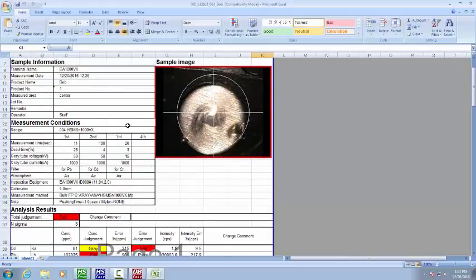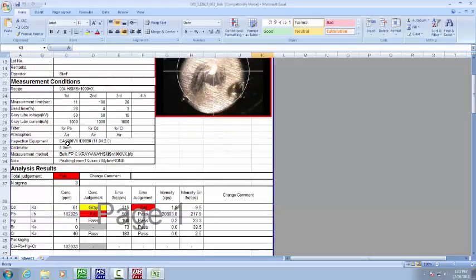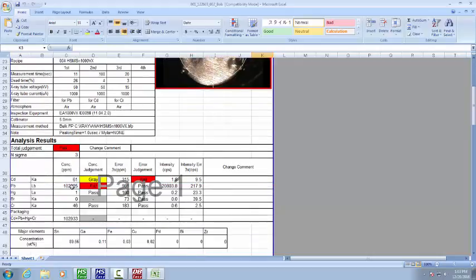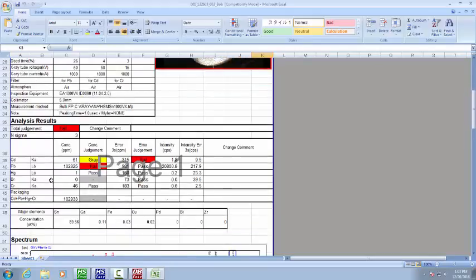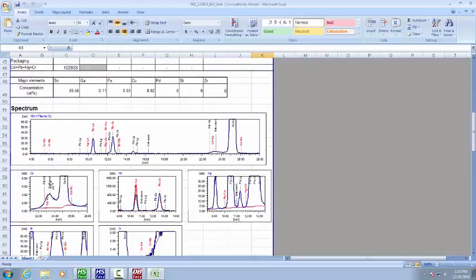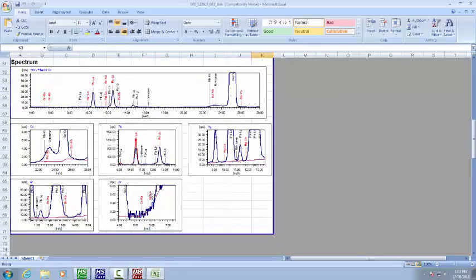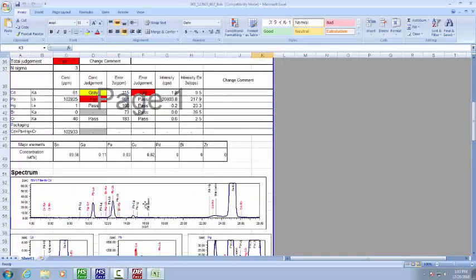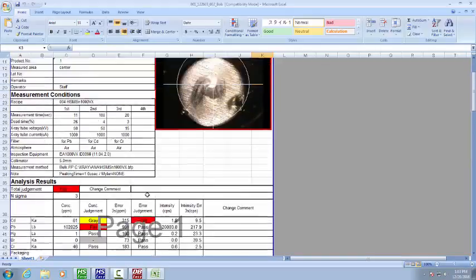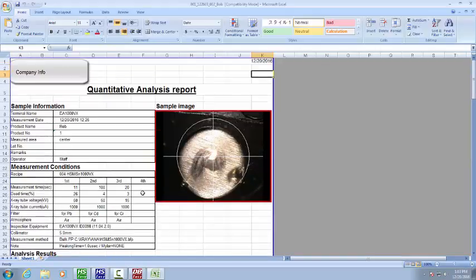This is the sample information up here on the left. You can see a picture of our image, our measurement conditions, and all our analysis reports here. You can see the spectrums of each one in case there's a question. You can see for each condition, each element, exactly what was seen that day that the sample was done.